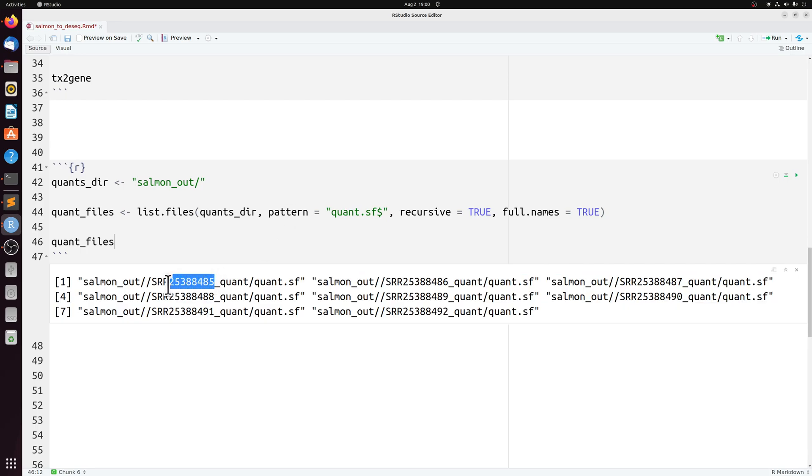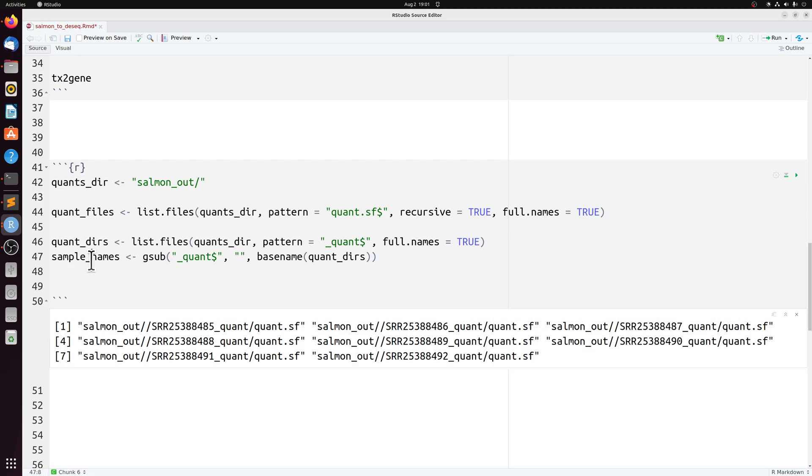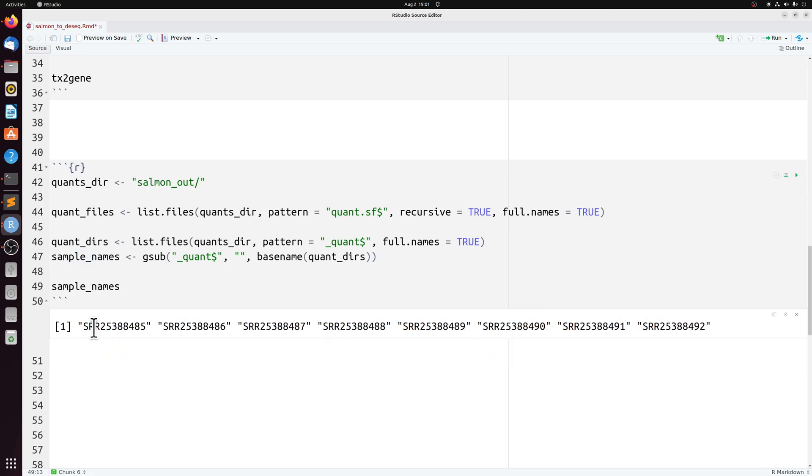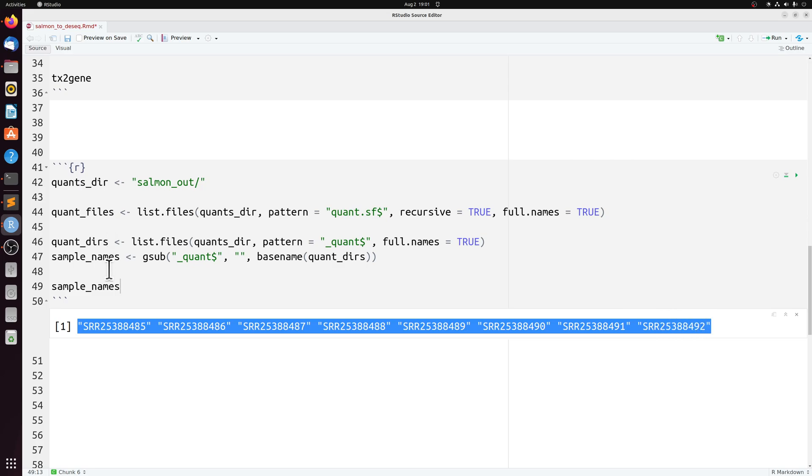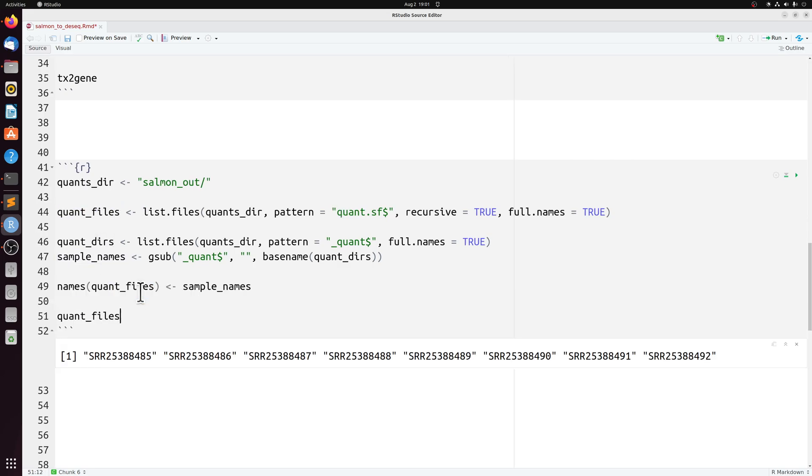Now I want the actual sample IDs. You can do this several different ways, like with stringr. But I'm just going to use list file again to get the directory name and then gsub to get rid of the underscore quant. So now if we look at sample names here, it's just the sample names.